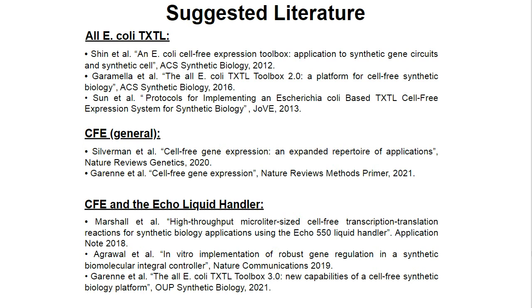In this slide, we propose some literature about the E. coli cell-free expression system that was presented in this webinar, some literature about cell-free gene expression in general, 2 review articles if you want to know more about cell-free gene expression, and some articles using both cell-free gene expression and the Echo Liquid Handler from Beckman Coulter Life Sciences.